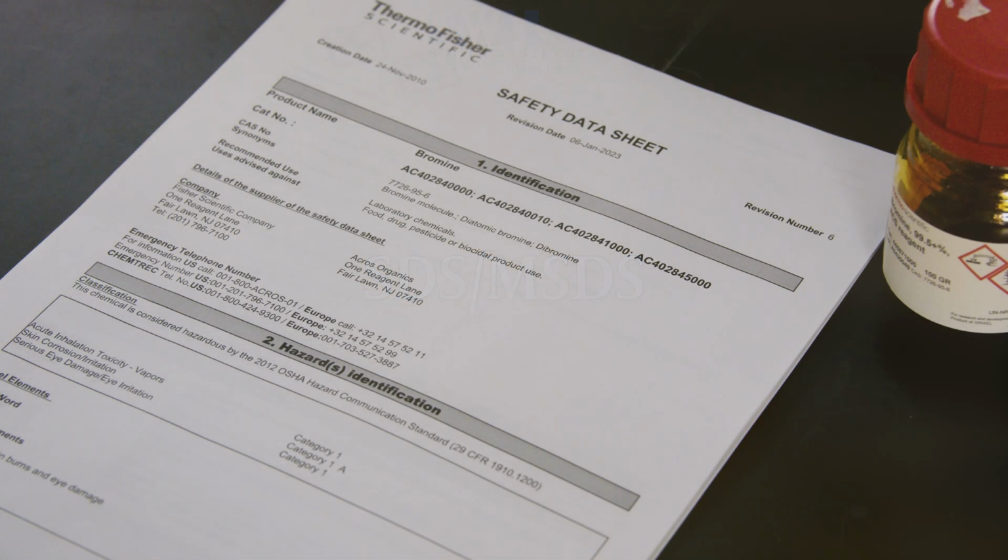We mentioned before that the safety data sheet, formerly called the material safety data sheet, should be referred to when determining the proper safety measures for hazardous material. So what exactly is a safety data sheet, and why is it important? Well, a safety data sheet, abbreviated SDS, is a comprehensive document that provides detailed information about hazardous chemicals used in the lab. Think of it as your lab safety playbook.